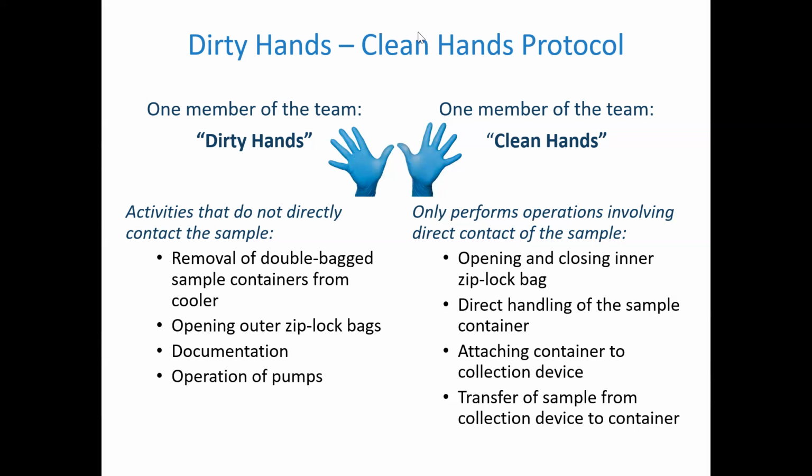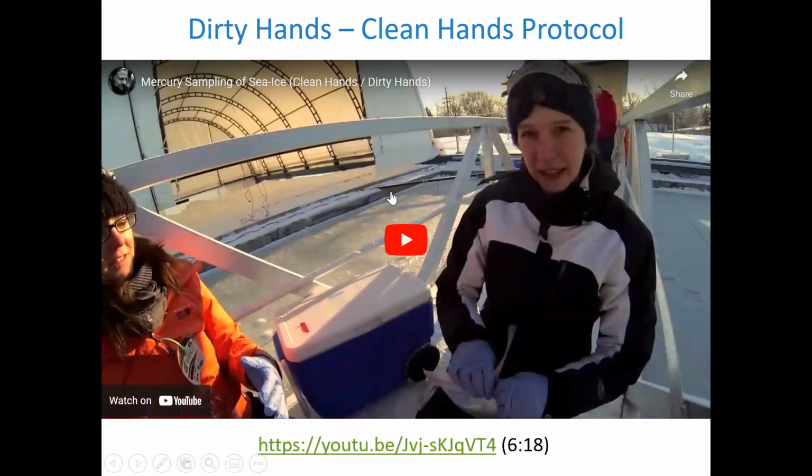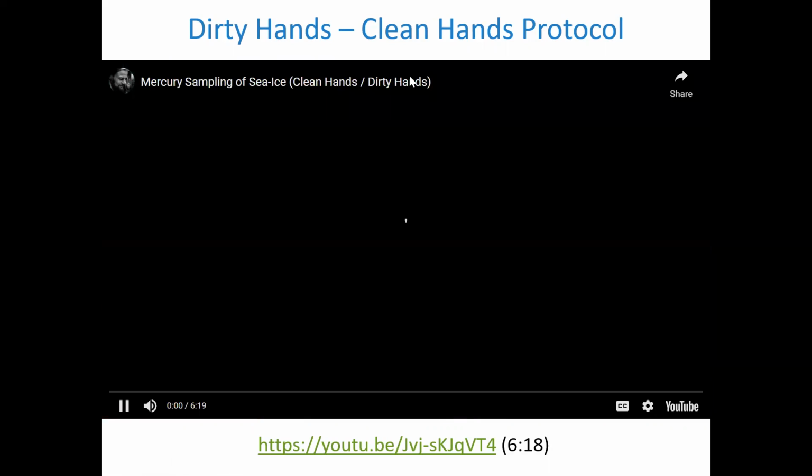So what I'm going to do is, like I said, I have a really good video here shown by these women, and it explains it very well. They're testing for mercury, I think, and it's on some ice anyway. So I'll play this for you, and they do a very good job of explaining the clean hands, dirty hands protocol. So I'll press play right now.